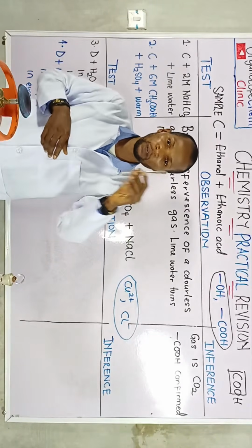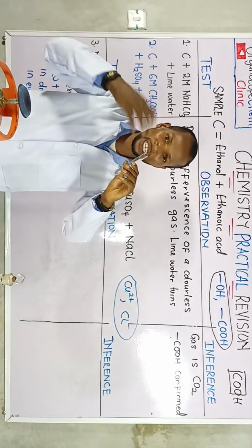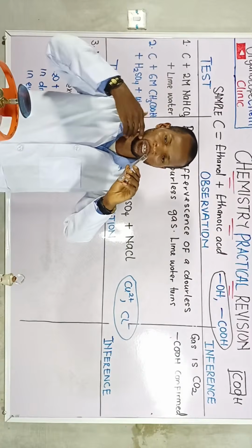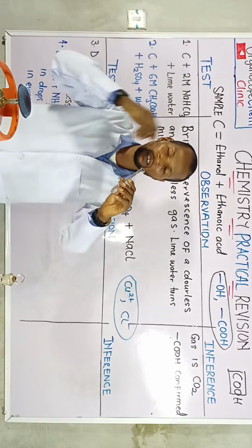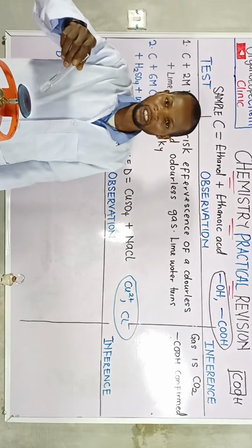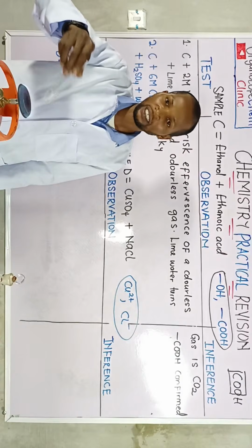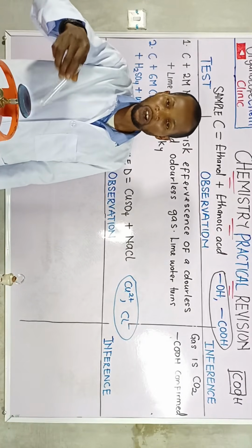The pleasant fruity aroma coming from this mixture is indicating what formation, what has been formed? Which compound has that characteristic fruity aroma? Type in the comment section. So this is how to heat.